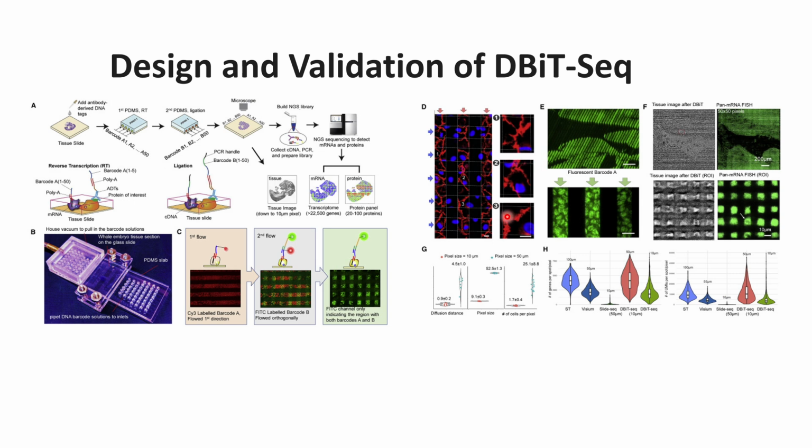And similarly for the cell adhesions linkage also, we can see that only the region that comes in the vertical directions get linked, and the region that's not in the channel does not get stained. So this further validates that there is very negligible leakage in the DBiT barcoding.